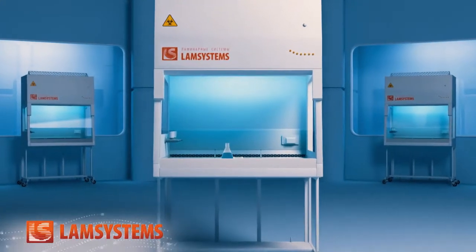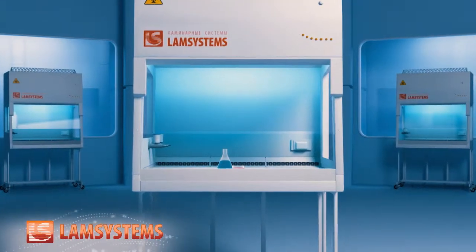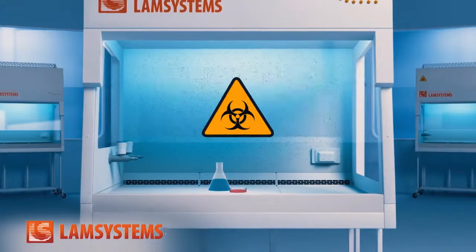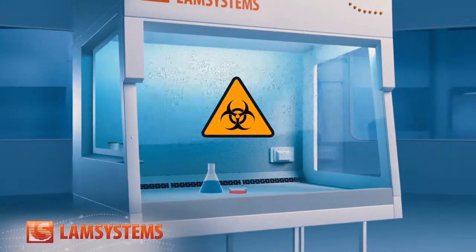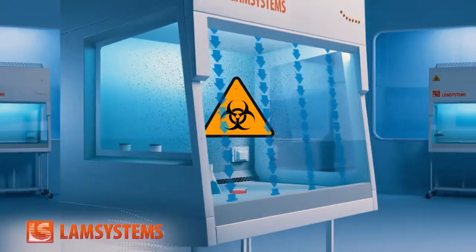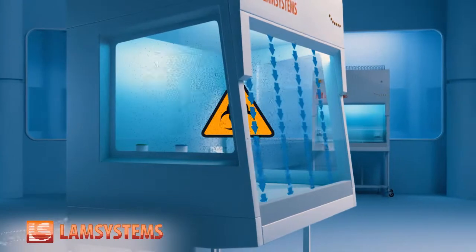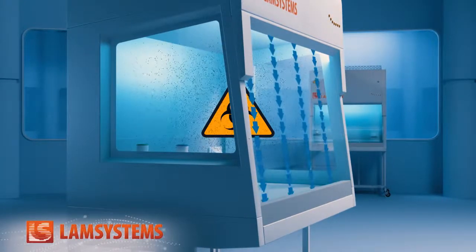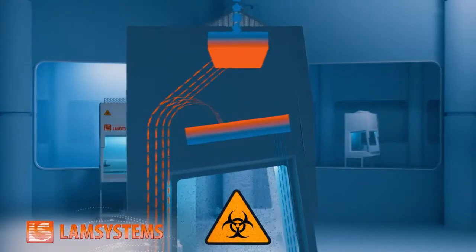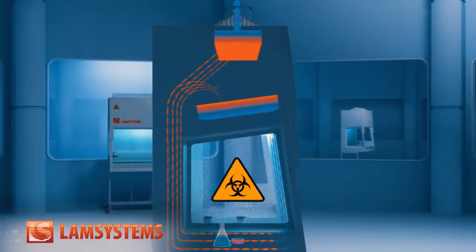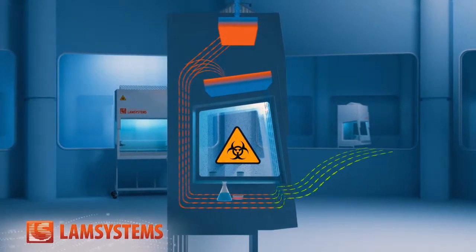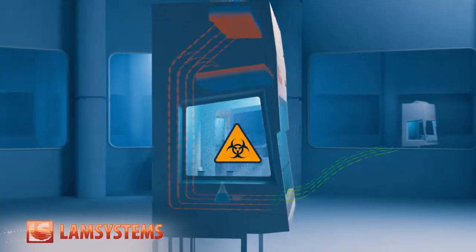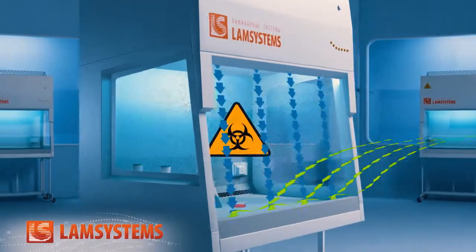One of the most important factors in the level of protection of a microbiological safety cabinet lies in its ability to contain hazardous microorganisms through the use of an air curtain. But how to verify that the airflow rendered is truly a reliable barrier from pathogenic agents and microorganisms? Will it really prevent the outbreak of the microbes of dangerous diseases into the external environment?